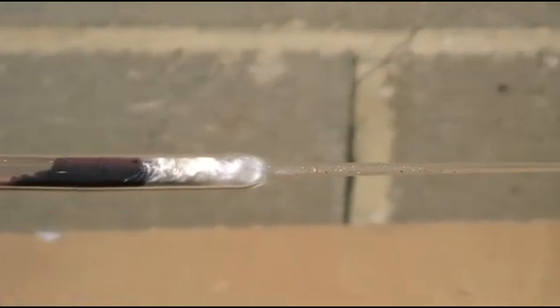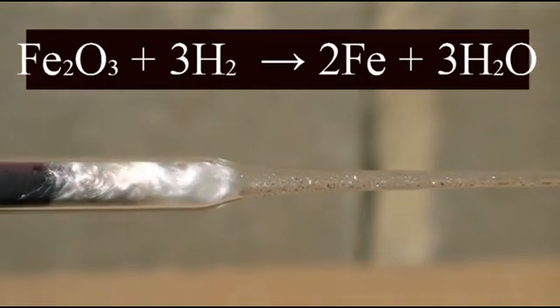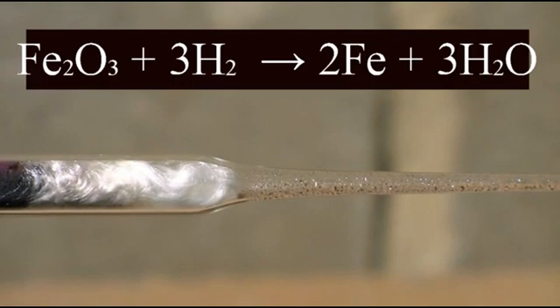If we look towards the end of our reduction tube, we can see some water has condensed, and this is one of the products of the hydrogen reduction of iron oxide.